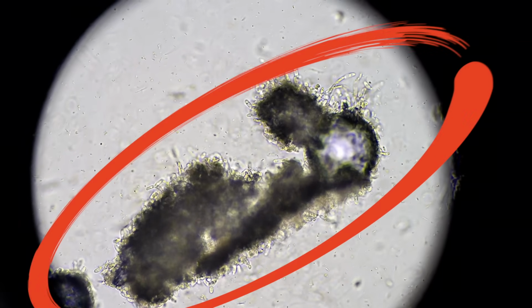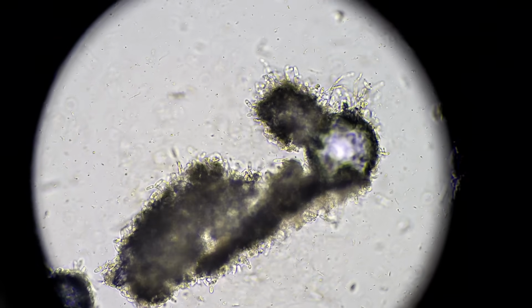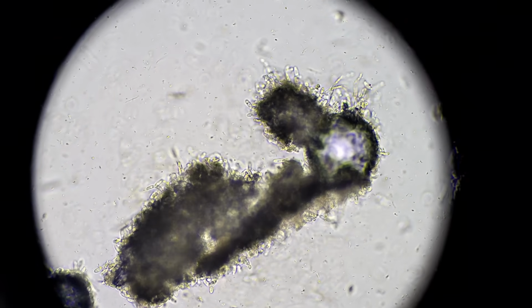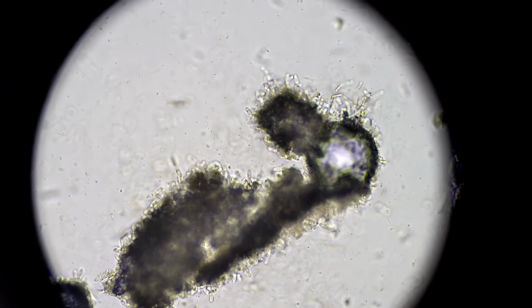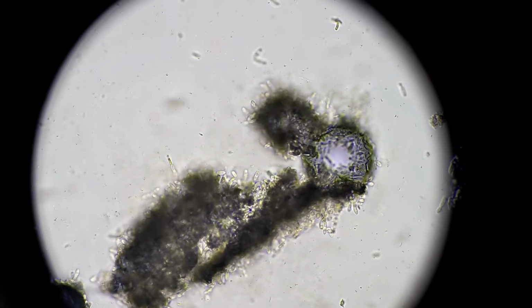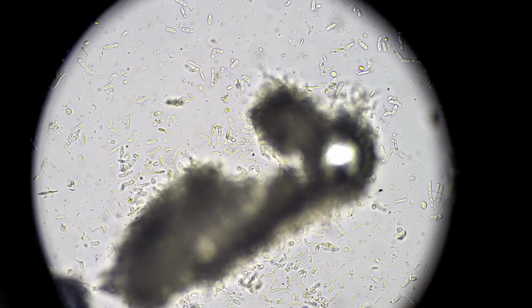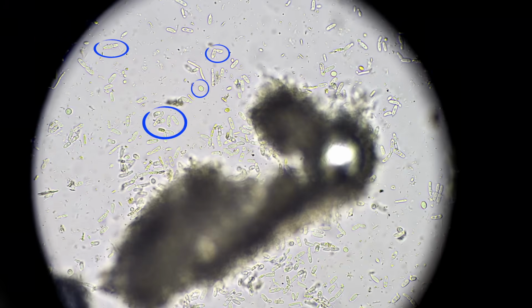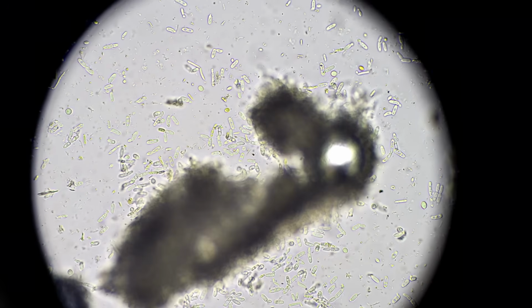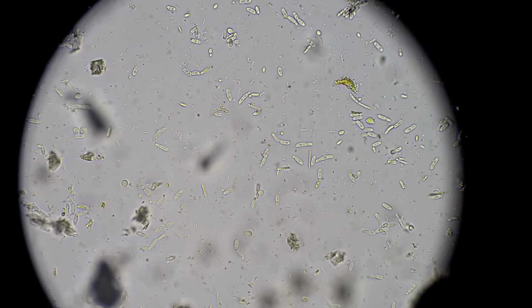So this is all just yeast. This is really healthy, plump, happy yeast. We're already seeing some long rods. We're not even there, though. By looking at this, the top of this is up here. We're zooming down. And then, wow. So this shows you the diversity of shapes and sizes of yeast. All these large things are yeast, even the ovals, even the longer ones.